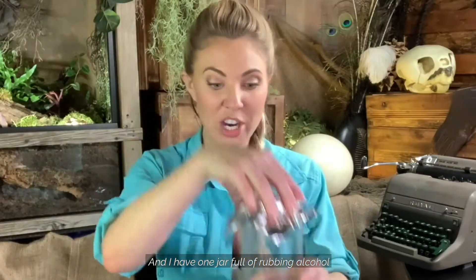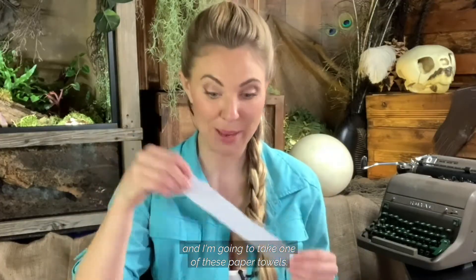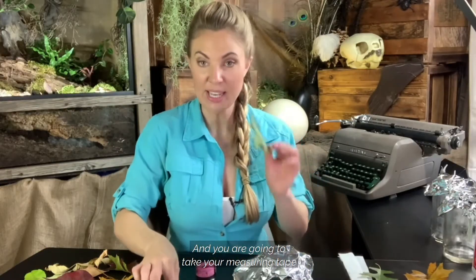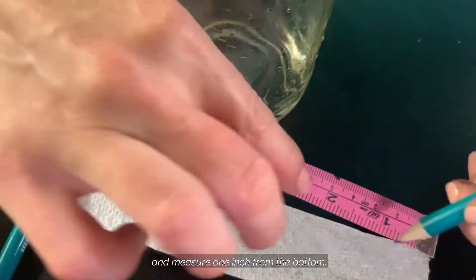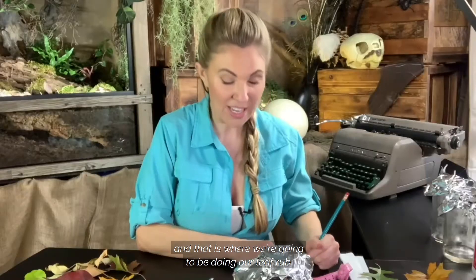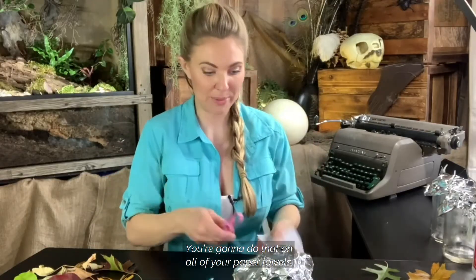I have one jar full of rubbing alcohol and I'm going to take one of these paper towels. Take your leaf and your measuring tape and measure one inch from the bottom. Make a little pencil mark — that is where we're going to be doing our leaf rub. Do that on all of your paper towels.